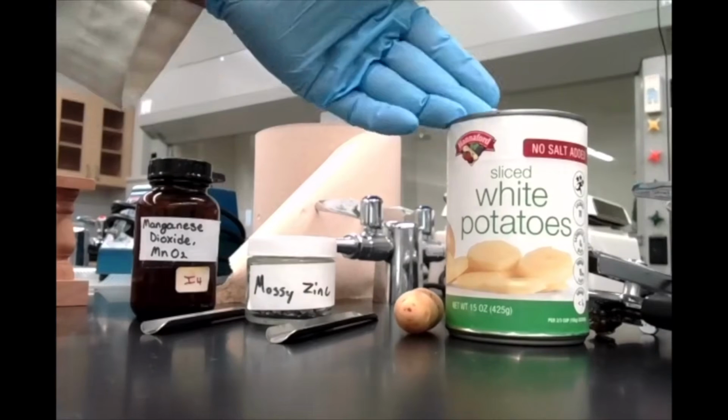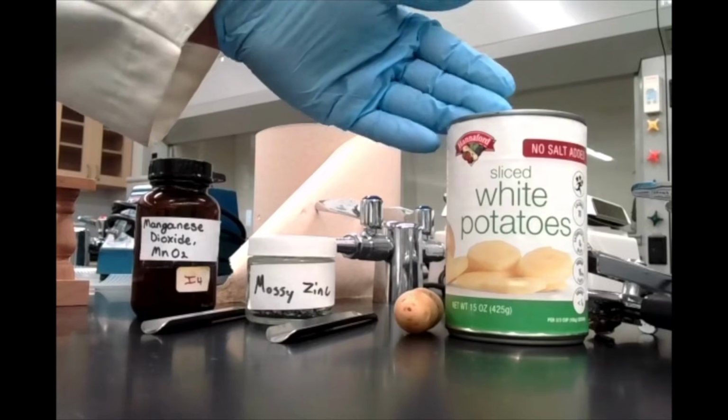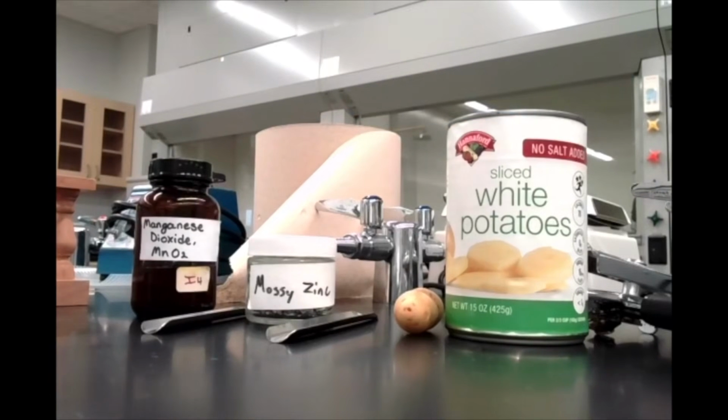Now, why are we using boiled potatoes as opposed to a regular potato? Well, boiling actually denatures catalase. It denatures proteins in general. It causes the shape of the protein to change, and therefore it doesn't have the same physical properties, and in some cases chemical properties. So we're going to see whether the denaturing of the catalase protein in your potatoes stops it functioning as an enzyme, stops it functioning as a catalyst. Something to keep in mind when you see the results of this part of the lab.